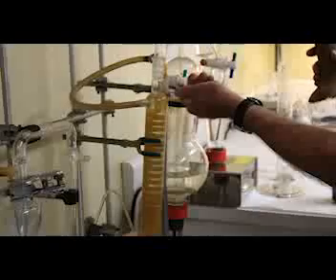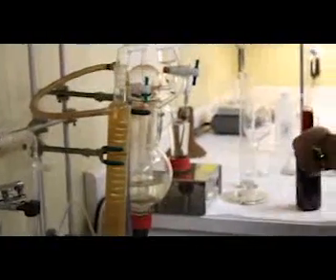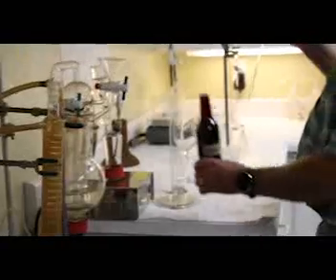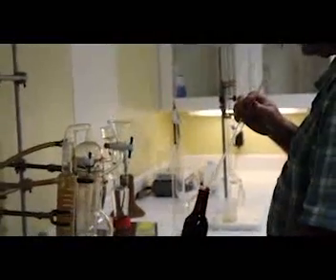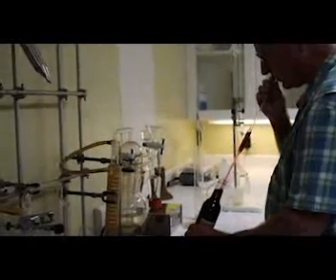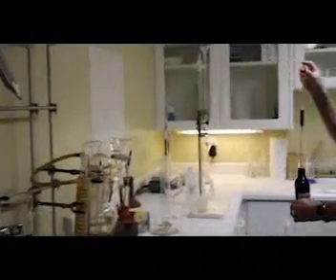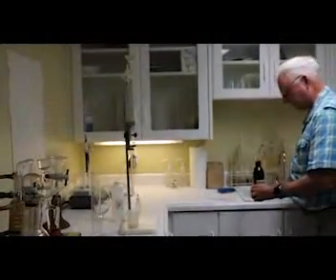So now I'm going to close it up, and I'm going to add 10 mils of my sample. This is a 2018 Bowman Zinfandel. Bowman is one of the shareholders in this company. I've been making wine off this vineyard for probably 30 years now. It was planted back in the 70s.